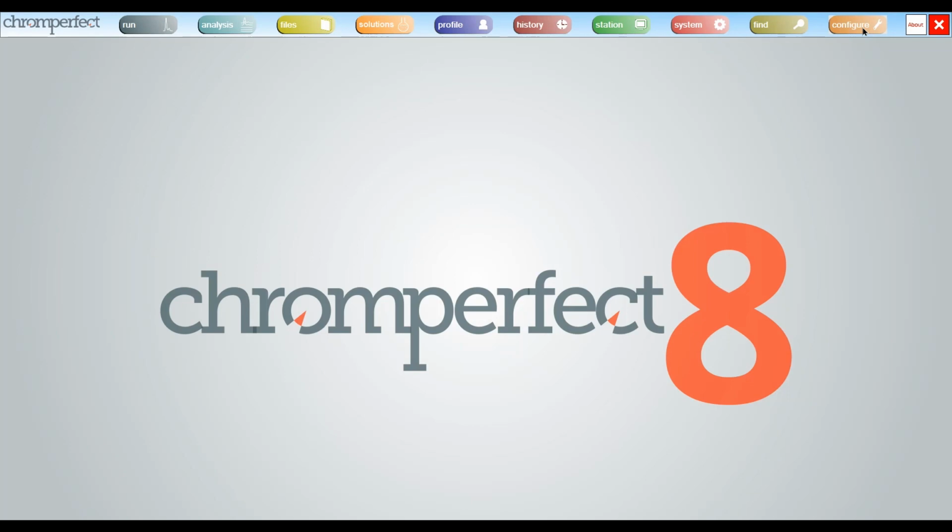We are now going to look at the process of uploading a setpoint file and using this as a master file which can be altered and saved under different names to prepare a library of instrument control files. The process for creating instrument control setpoint files is very similar for different instrument makes and models. However, it is important to understand that each different type of instrument file has a different extension.